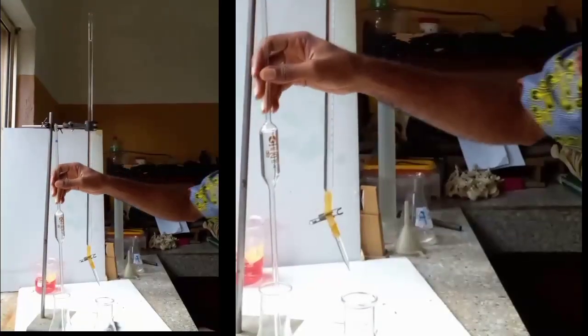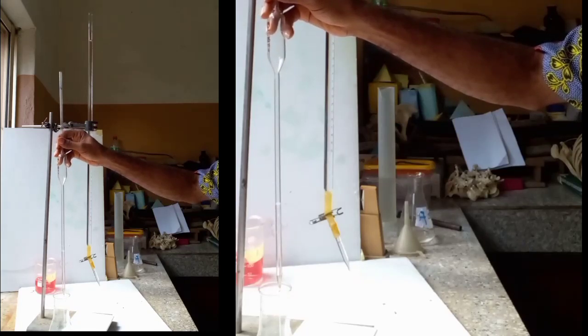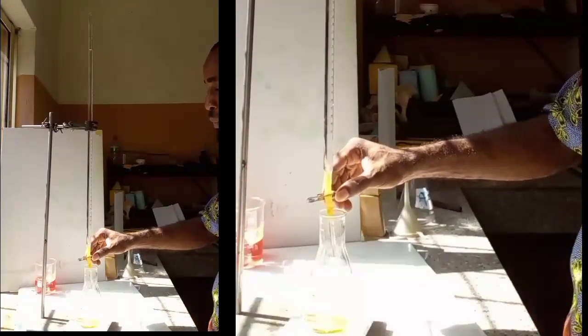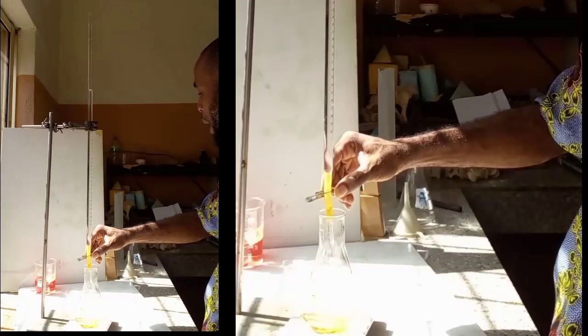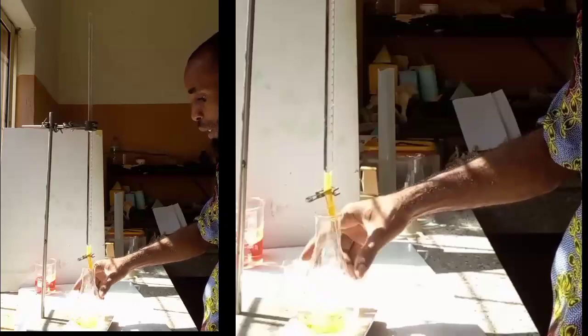Empty the beaker into the conical flask I'll be using. I add my indicator. Make sure you check that this thing is at zero before you start. There might be leaking. I am going to be very, very careful at 27. I am going to see a change at 27. If you are looking from the screen, you can see that there are possible changes happening.